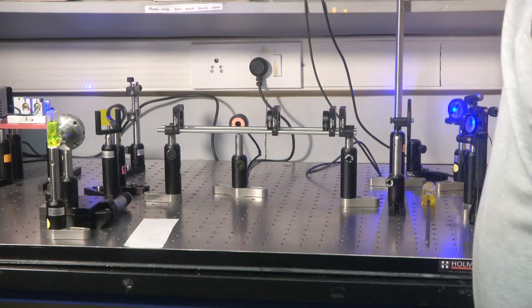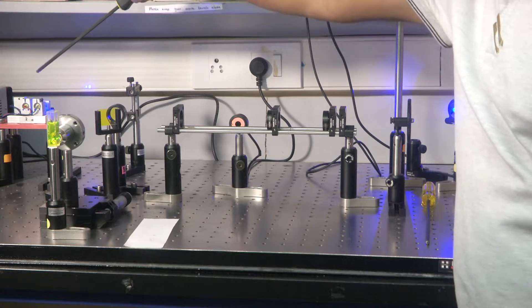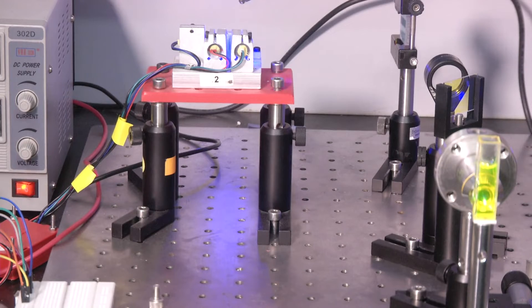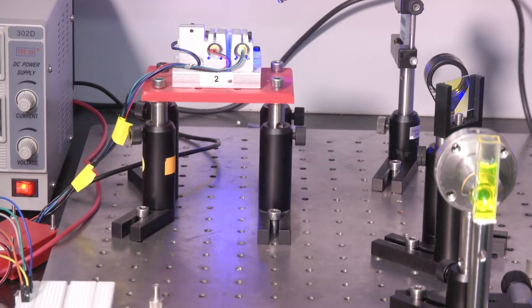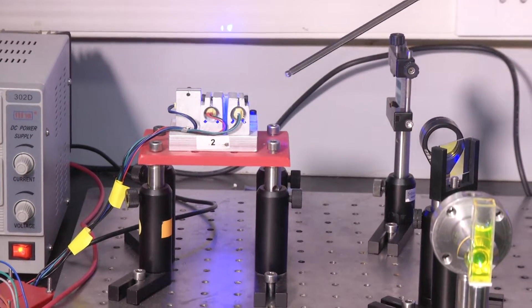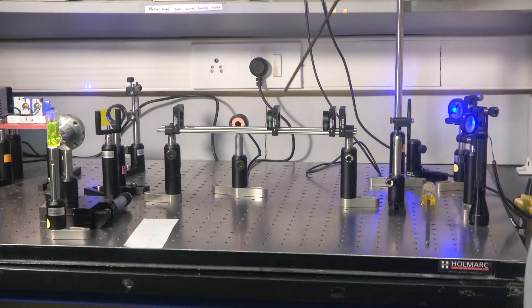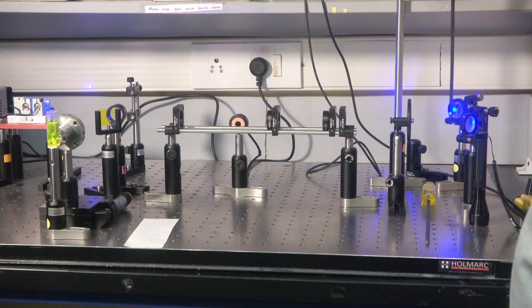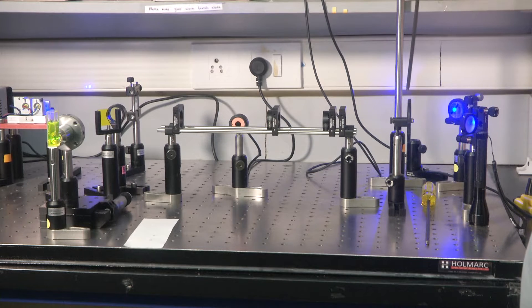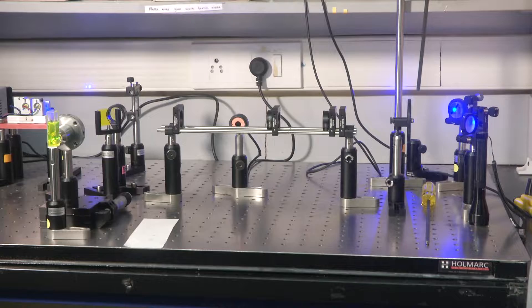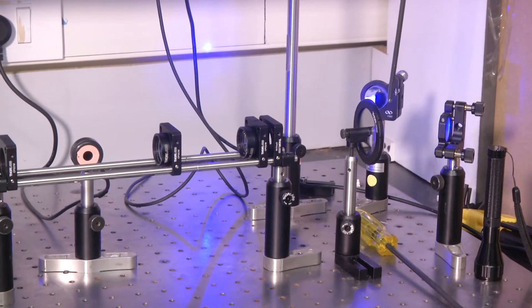Just a quick recap: the light source, we have three light sources, three laser diodes. We are operating only the 470 nanometer, and that blue light is coming through here, hitting this mirror, hitting this mirror.